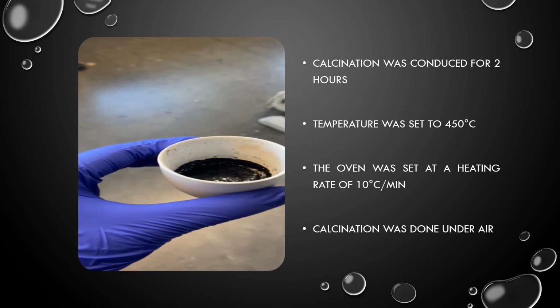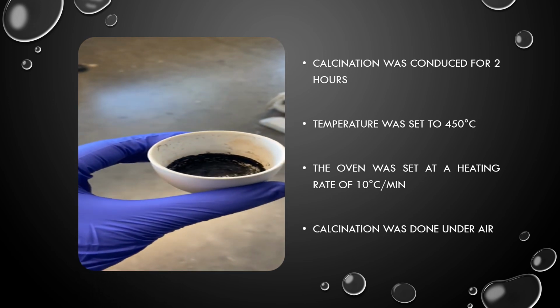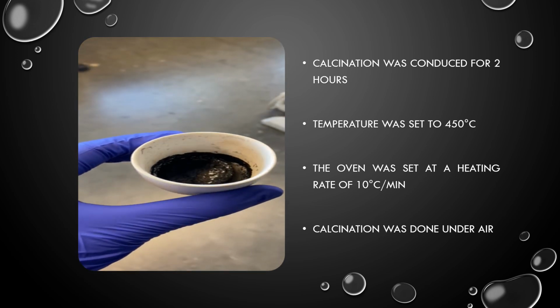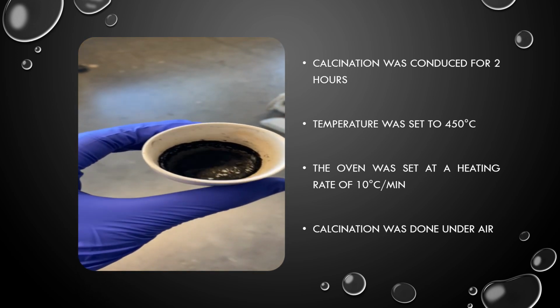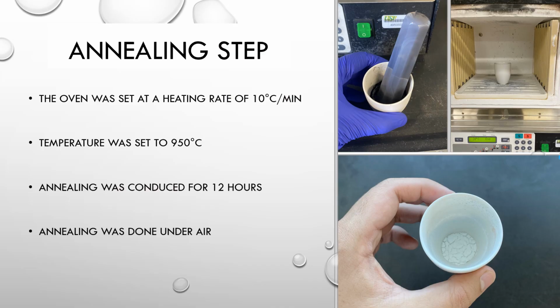This process causes the gel to boil up and slowly dry into a blackish solid foam, mainly containing an even mixture of lithium and zirconium carbonates. Due to the low reactivity of the chemicals used, this step was conducted under normal air.